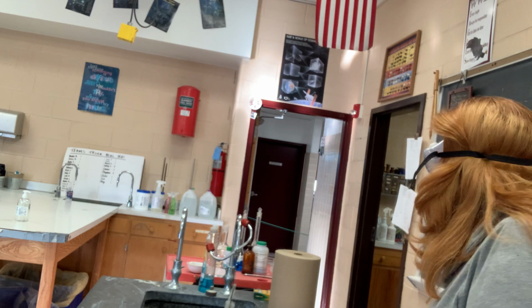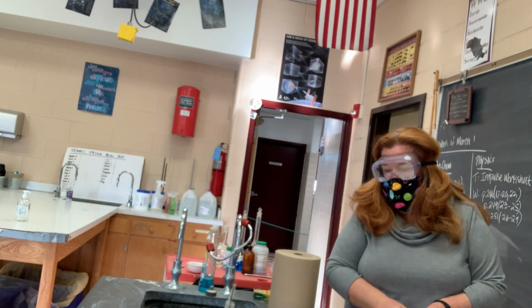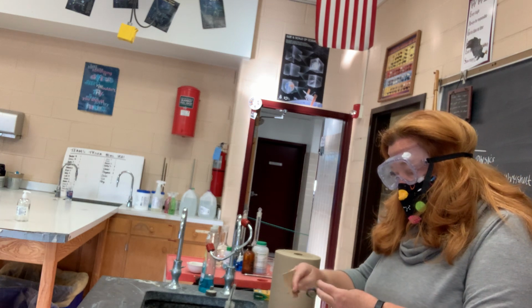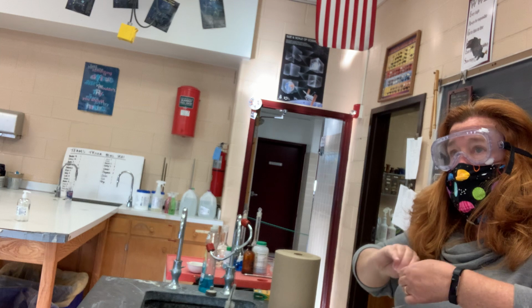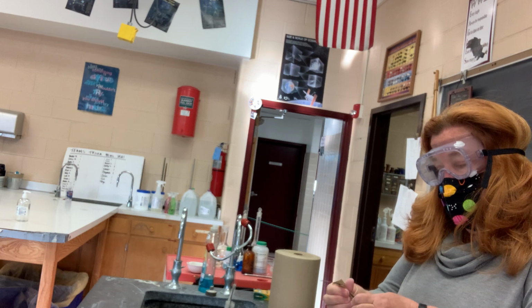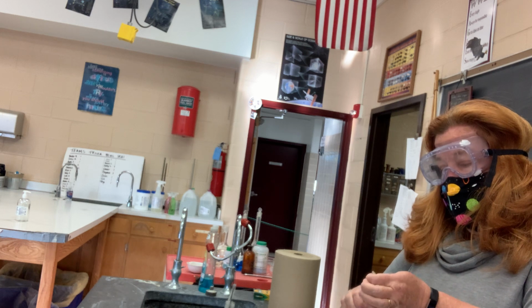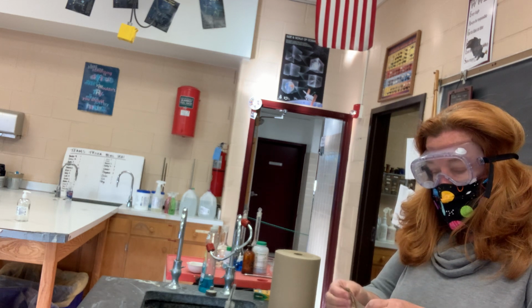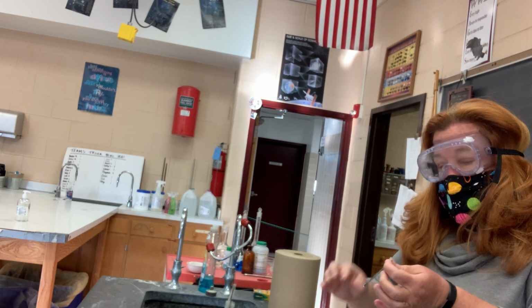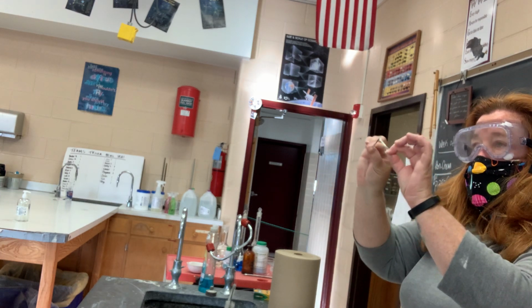And I'm going to start setting up the first one for you. We're going to burn magnesium, except now you know a whole lot more. Magnesium is soft because I can rip it with my fingernails. And then I'm going to clean it because there's some tarnish on it, so you can see what it normally looks like. I have a little piece of sandpaper here. If you look at the first reaction we're supposed to do, this is a synthesis. And we're starting out with magnesium, which is silver and shiny and flexible.